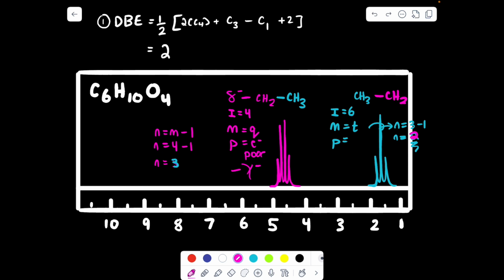So this would be pretty much 9 out of the 12 marks that you need to complete this question. So if you've done this, then you've pretty much gotten all the marks already. Oh, but wait, I actually need the ppm. The ppm, this is at around 1.5, so this would be E minus rich. So I'm going to assume the CH3 is bonded to the CH2 group, so it's not going to be attached to something delta minus, therefore it's going to be electron rich, hence it's very right on the spectrum.